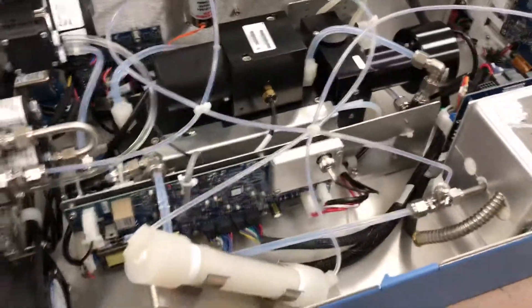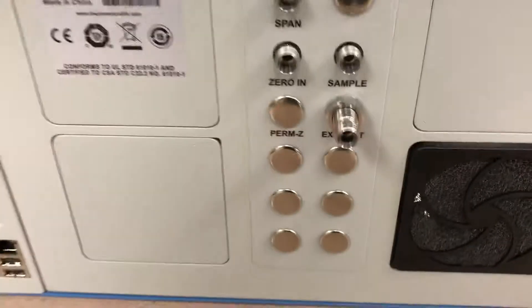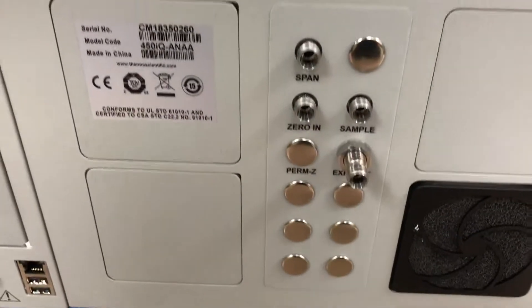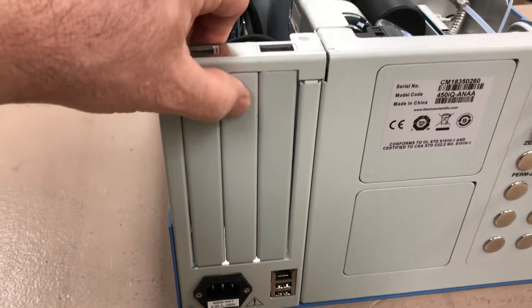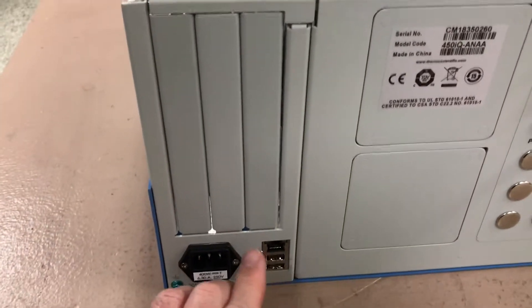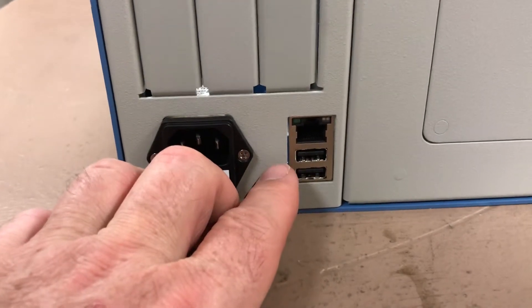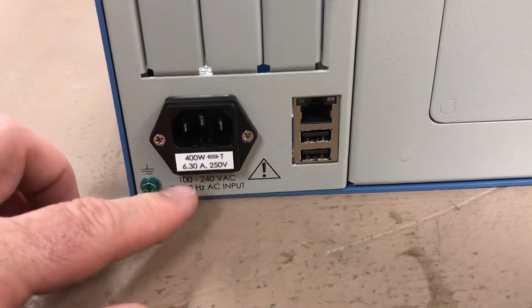Coming around the back, we've got the modular panel for the fans, zero and span, exhaust, and sample. This analyzer was purchased without the board options for RS-232, analog output, and digital input control — that's all been eliminated to reduce cost. It works with the Modbus Ethernet port, and there are two extra USB ports in the back as well, along with the same power cord and a fuse holder underneath.